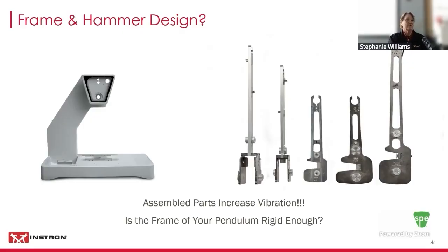The sample is going to vibrate. The hammer may bounce on and off. What you want to make sure, though, is that all of that is reduced. You want the frame itself to be rigid. ISO itself actually has an entire standard about the design of a pendulum, and that's ISO 13802. And that standard actually walks you through what a pendulum for tensile, Charpy, Izod impact looks like.